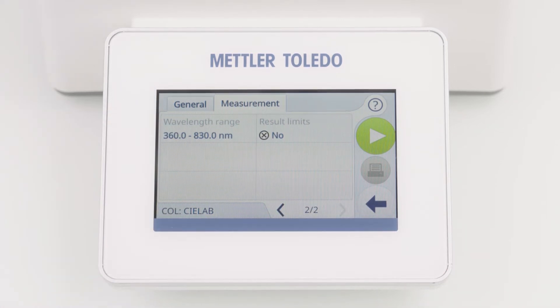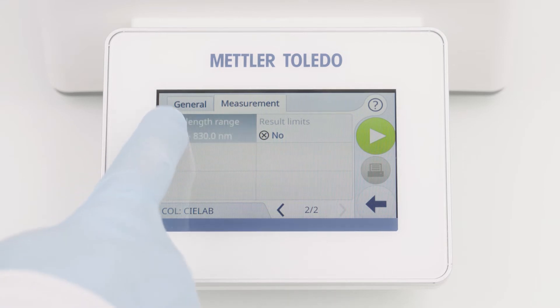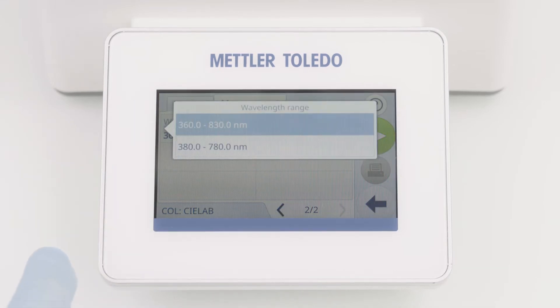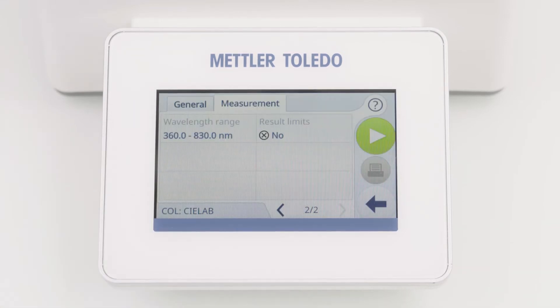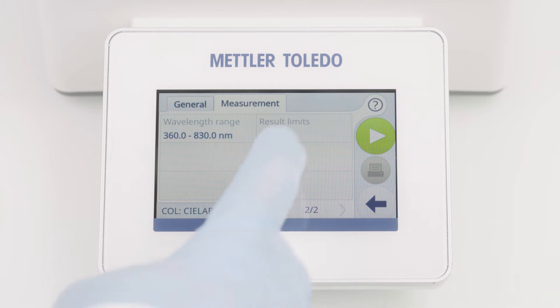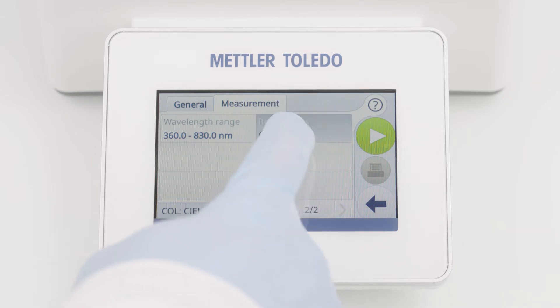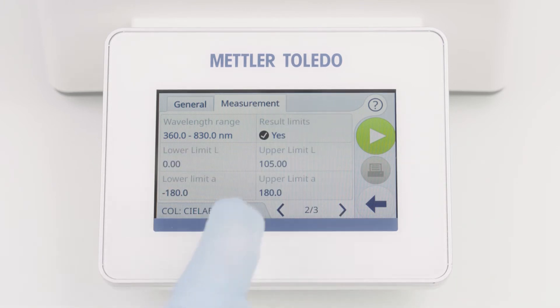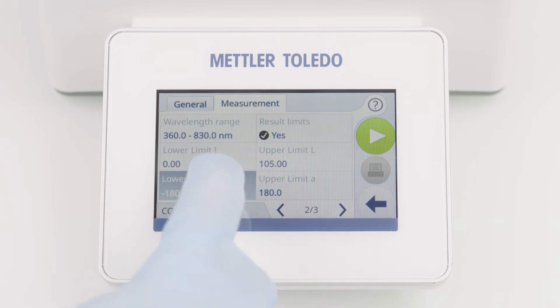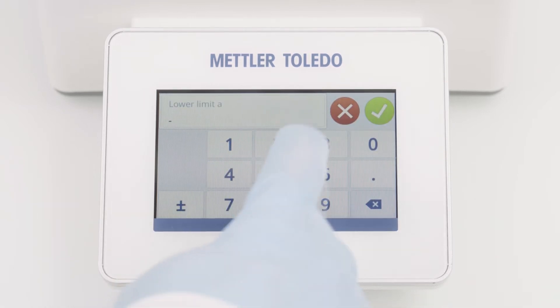On the second page, you can select the wavelength range, for example 360 to 830 nanometers. And last but not least, you can define your own result limits.